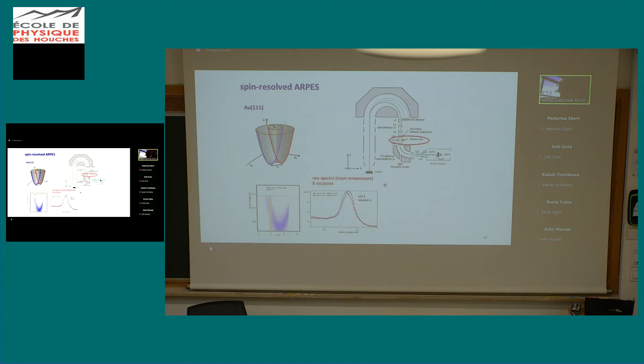So if you look now at our geometry, you see that the sample here for normal emission is given by the x y direction. So the spin will have x and y components, but no z component. If you look at the spin detector, the coils, I told you that the magnetization by the coils gives you the components of the polarization which we can measure, and this will be coil 1 and coil 2 measuring the z and the y direction.